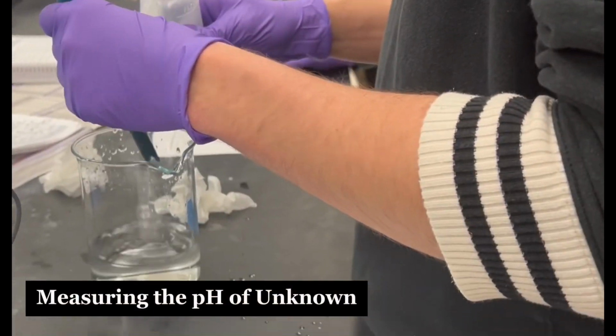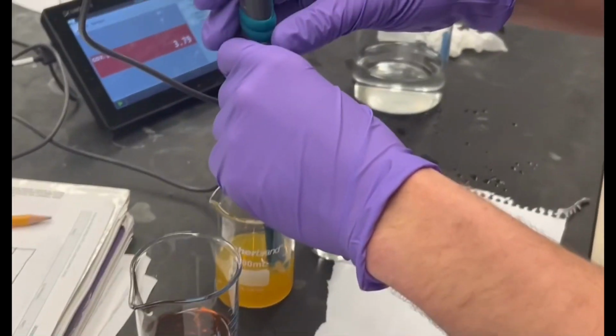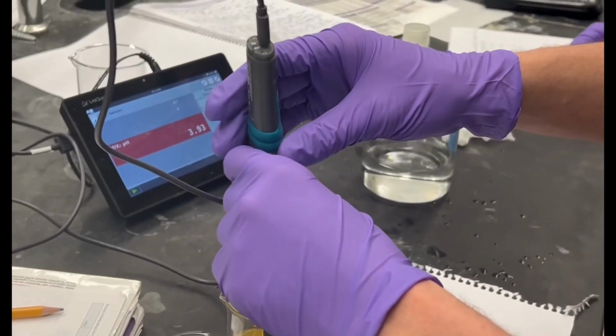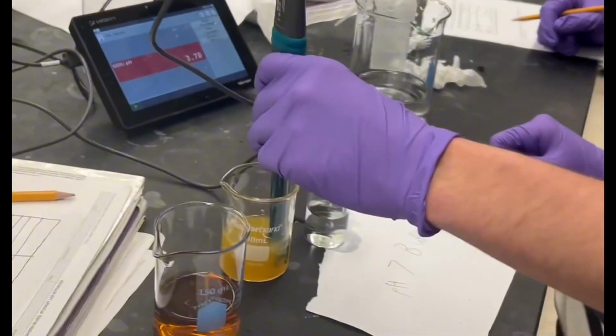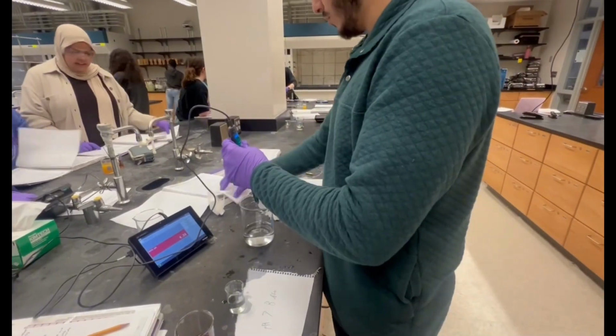When measuring the pH of the unknown, make sure to rinse the probe with distilled water after every use. And make sure you record the pH with the appropriate amount of decimal places. The pH of the solution will be the pH that is most constant on the pH meter.